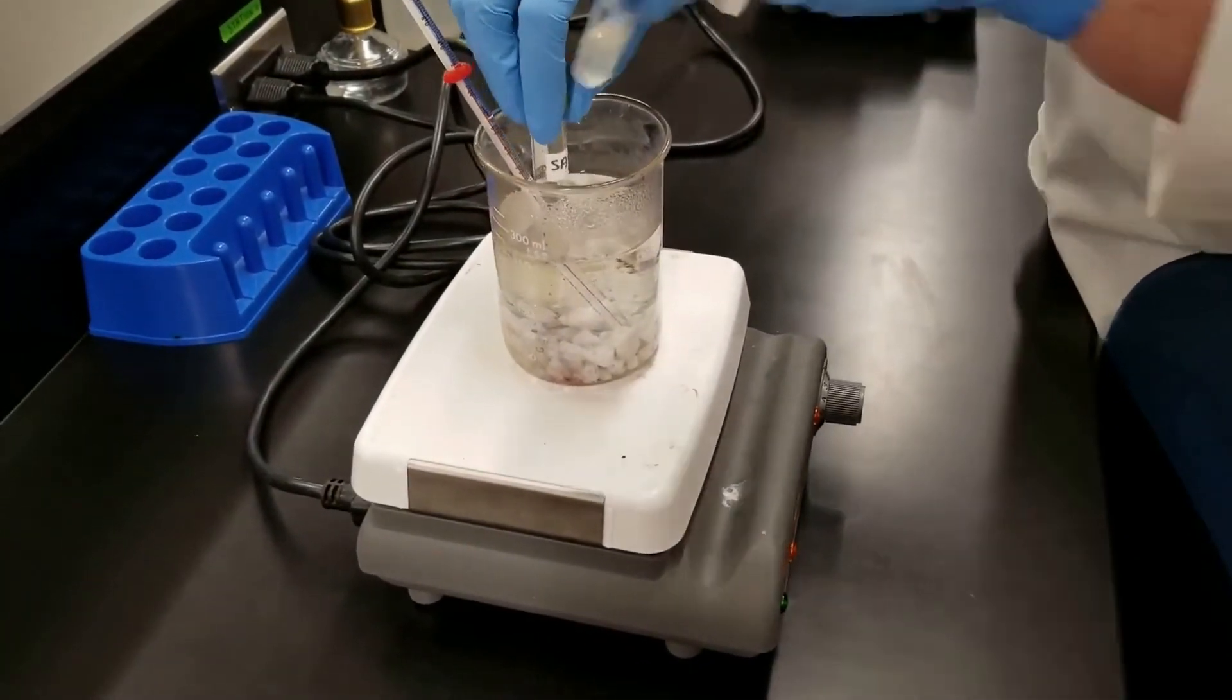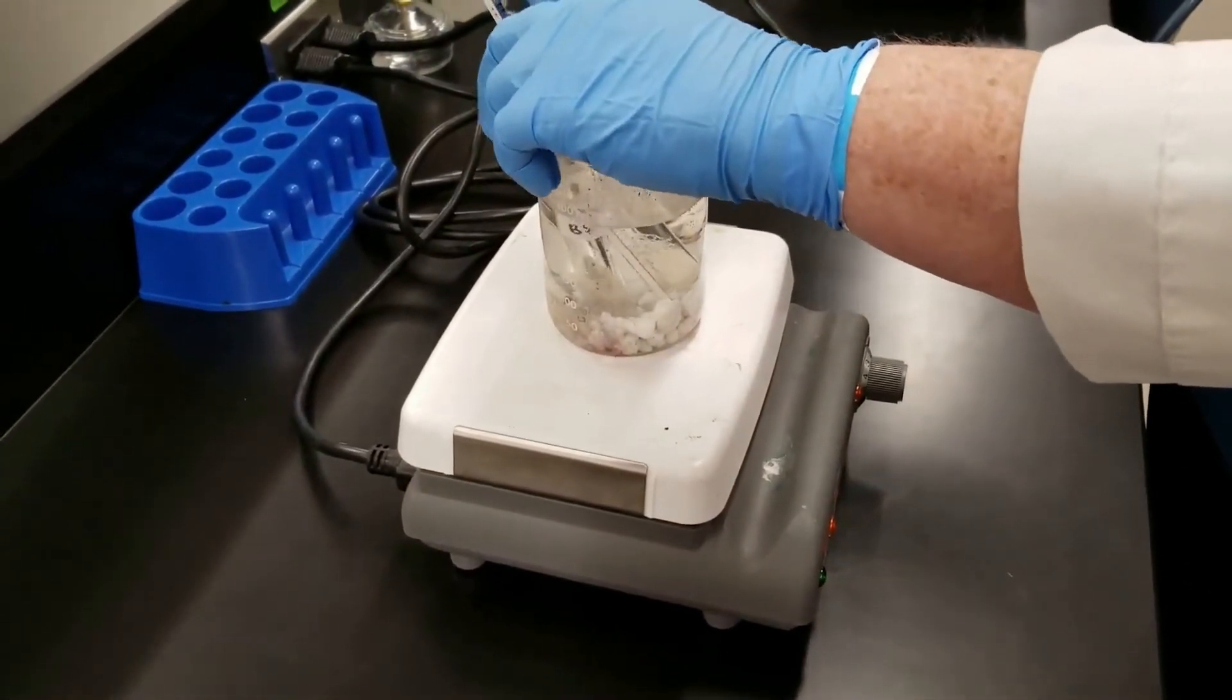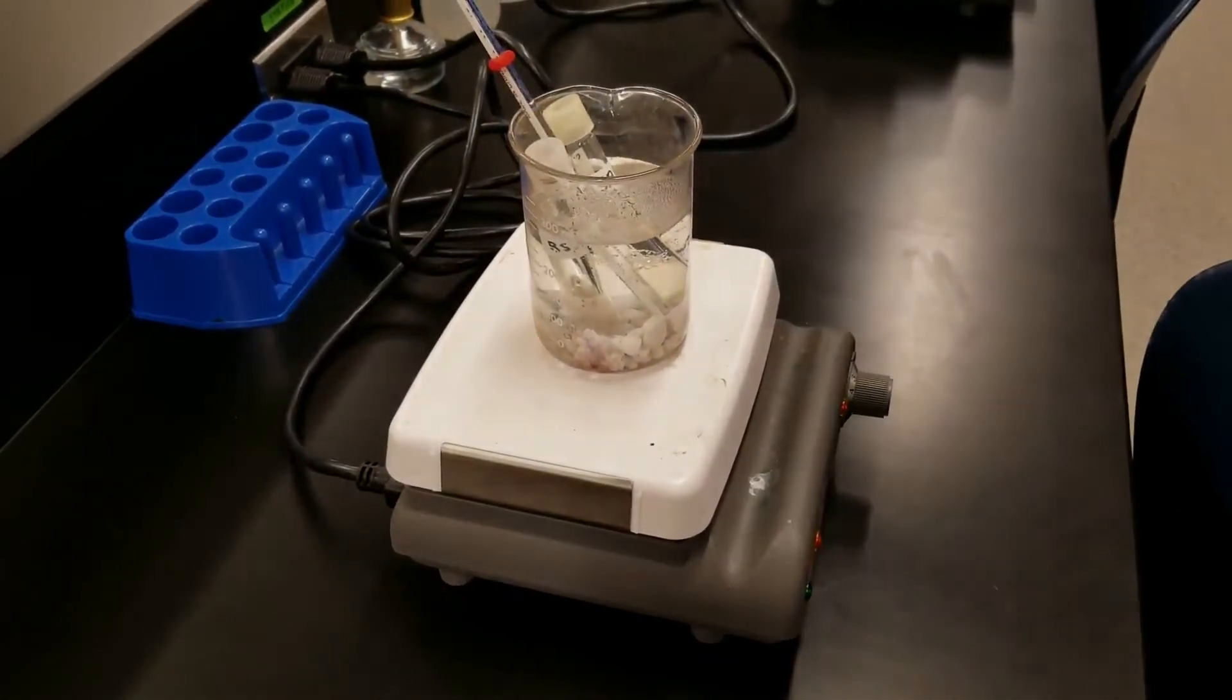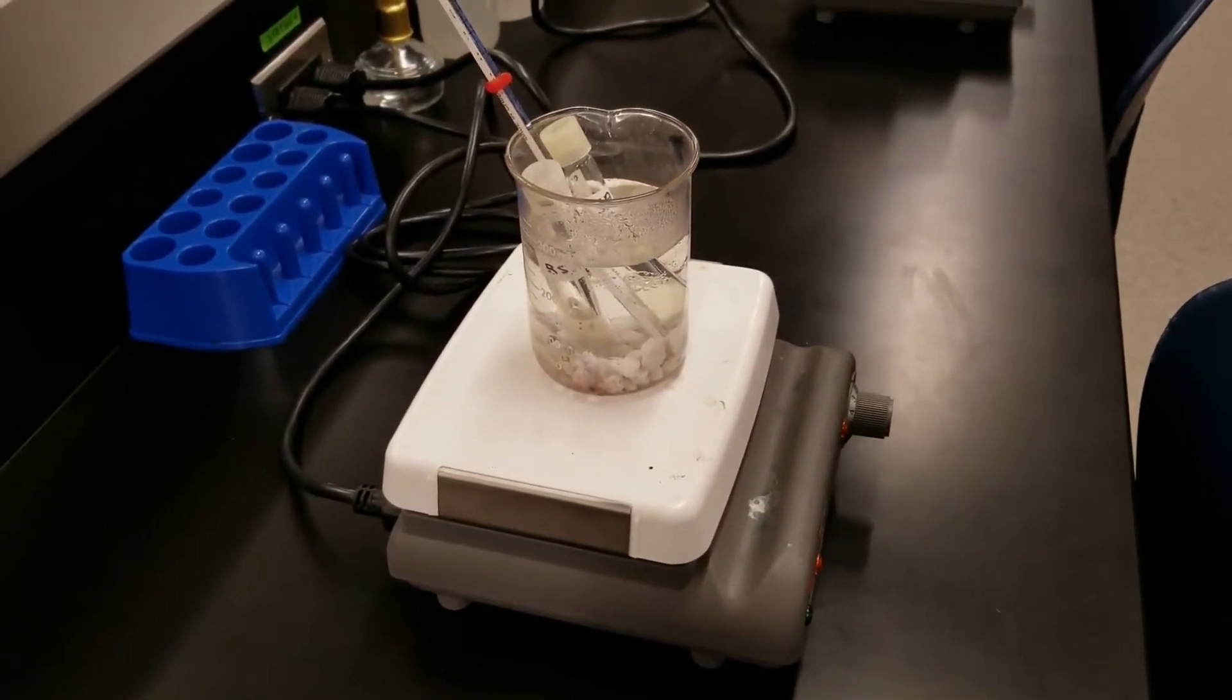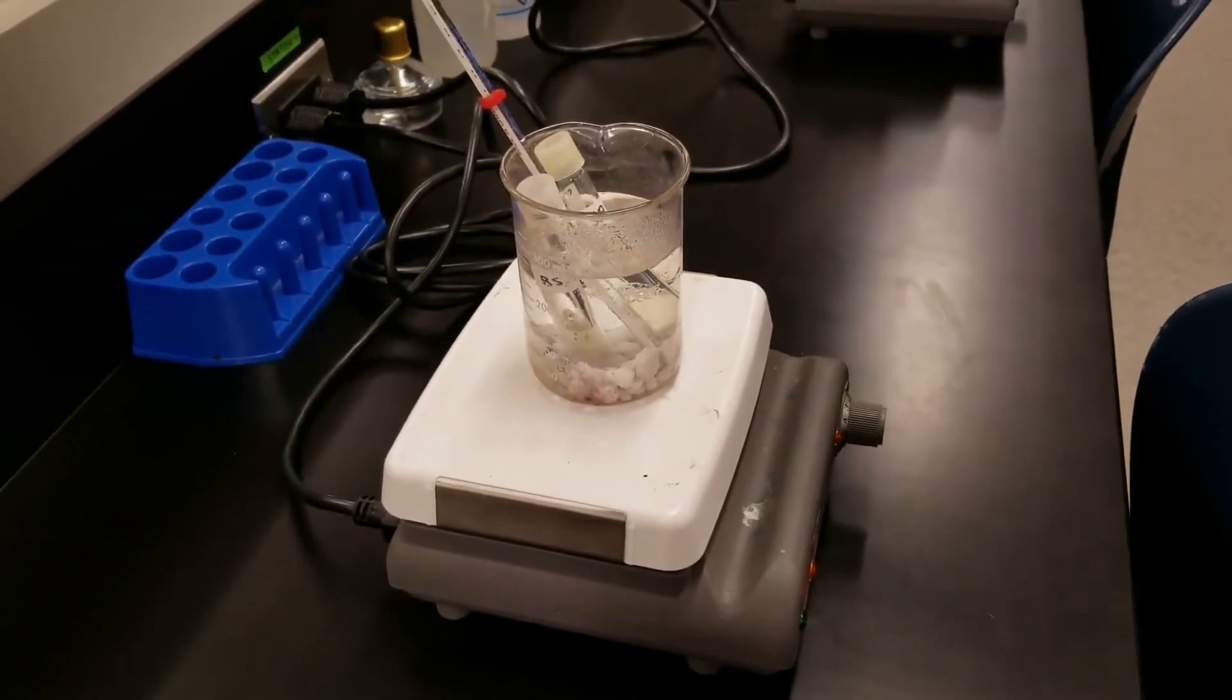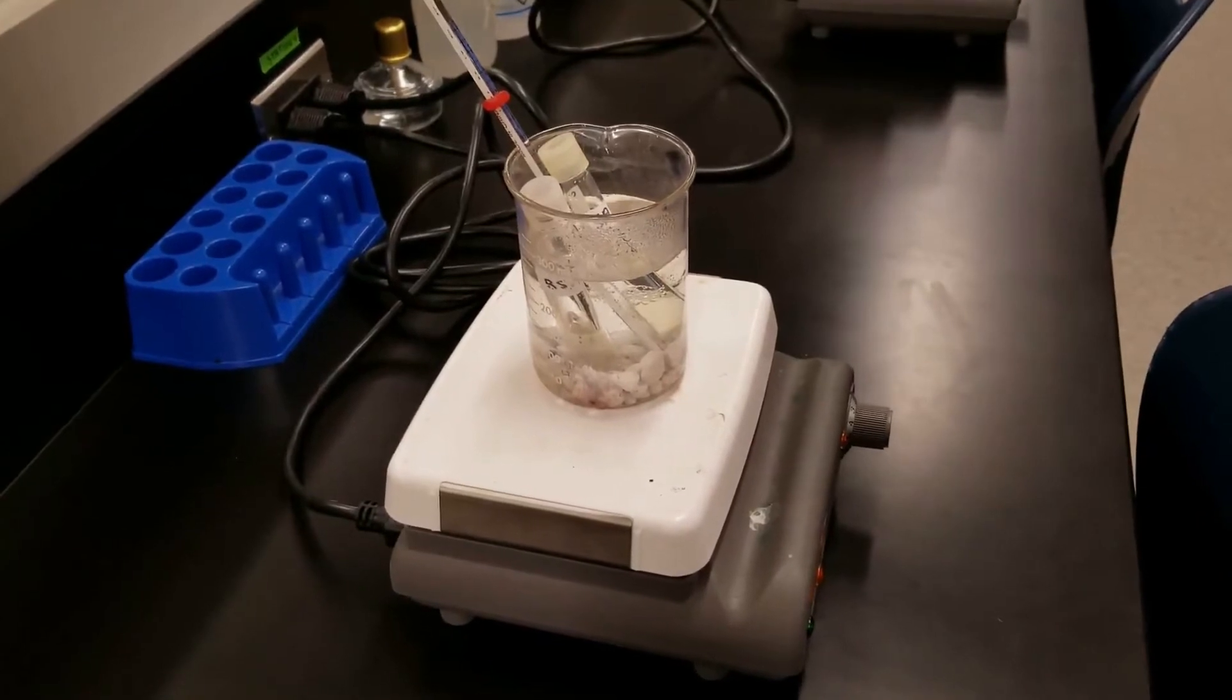We're going to put the tubes in here and time it for 10 minutes. So this is 40 degrees Celsius. As a point of reference, human body is 37 degrees Celsius. We'll leave it in there for 10 minutes, and then we remove it. We will streak it out on a plate, and then we will move to the next temperature, which will be 80 degrees Celsius, and then the final temperature will be 100 degrees Celsius.